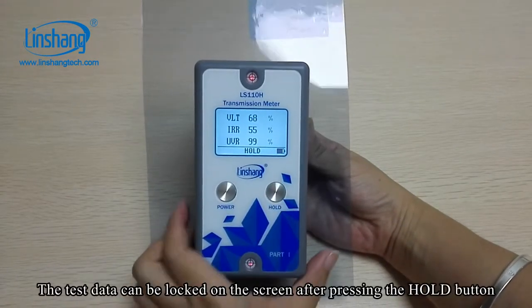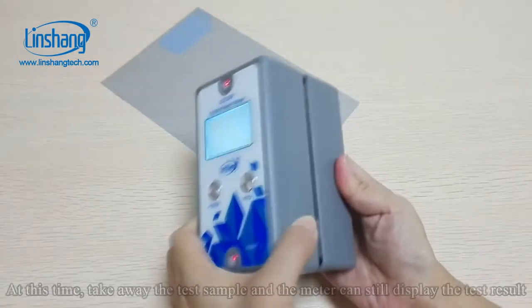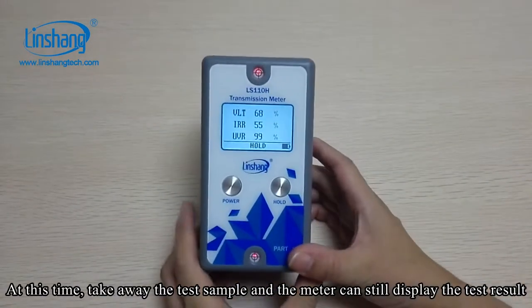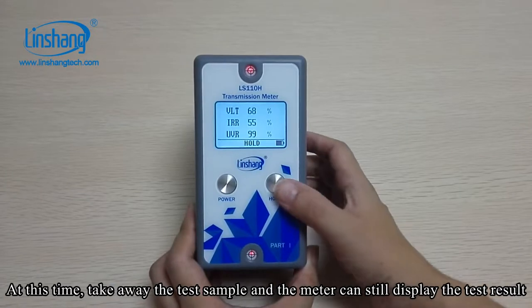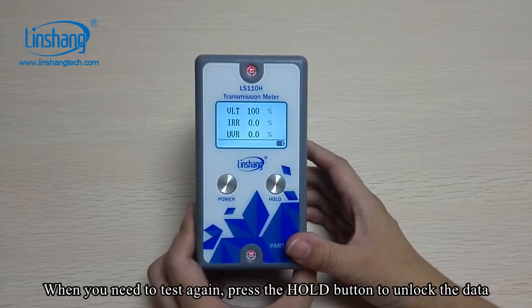The test data can be locked on the screen by pressing the hold button. At this time, take away the test sample and the meter will continue to display the test results. When you need to test again, press the hold button to unlock the data.